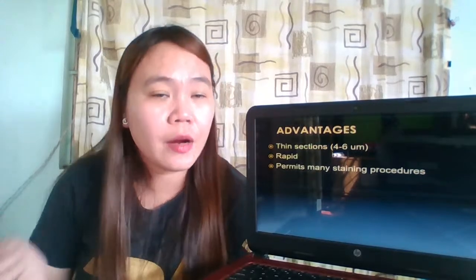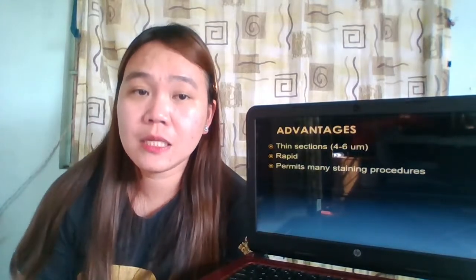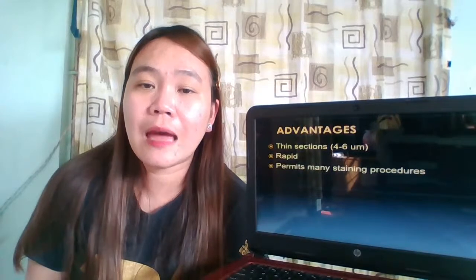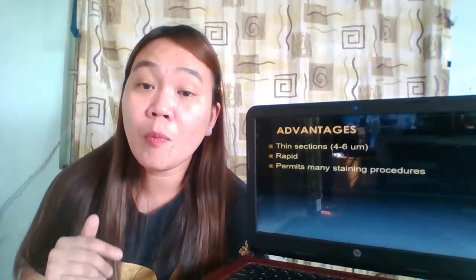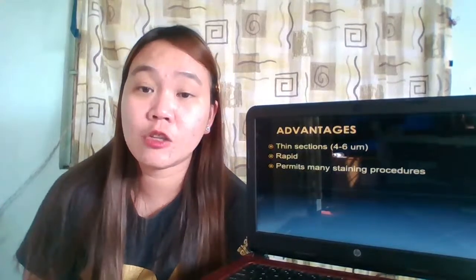Another important advantage of paraffin is that it permits many staining procedures. That means your paraffin is compatible with a lot of staining techniques that we use in histopath.